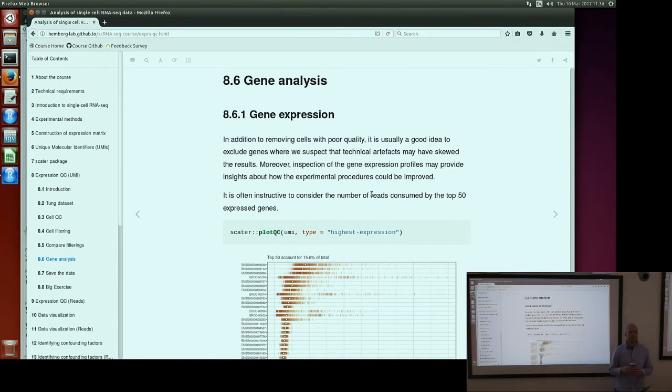I'm just worried about the format of the filters. They're literally true, false, so anything that produces the appropriate true, false set. Although they could also be 0, 1. If you add it as a column in the SCE set object, then it needs to be a vector of the same length as the number of cells. So in that case, indices that are true, false work perfectly.